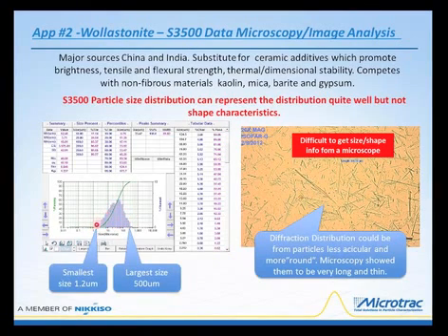But we really don't know much about this material as far as its total particle characterization is concerned. We do know it's a very broad distribution, and we do know there are coarse particles and fine particles. But if this distribution were to change, the question would be, why is it changing?